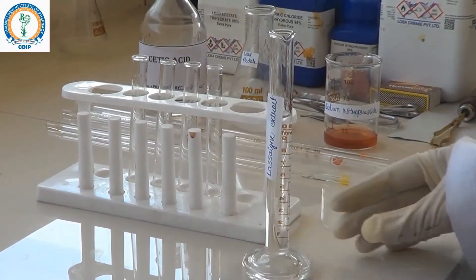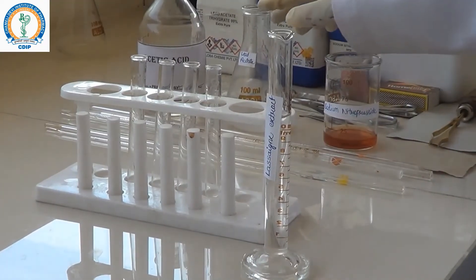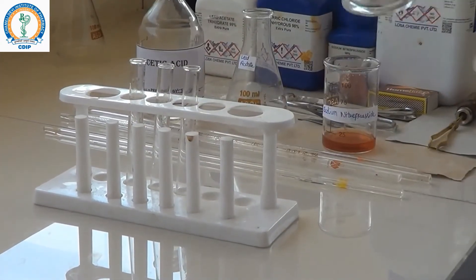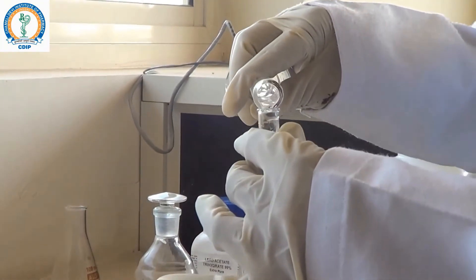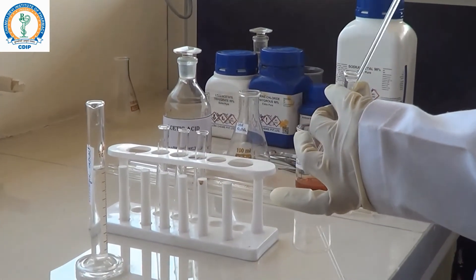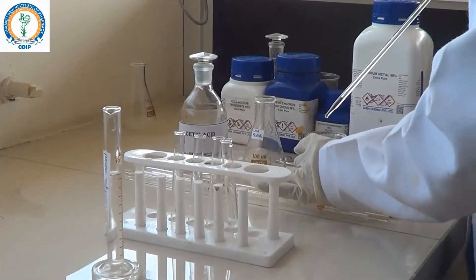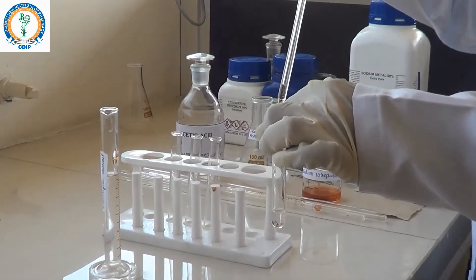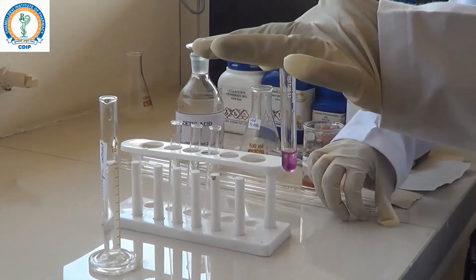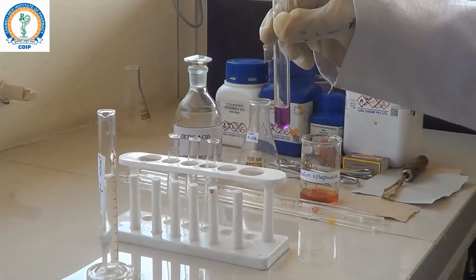For the detection of sulphur, there are two tests: one is the sodium nitroprusside test and another is the lead acetate test. First we will perform the sodium nitroprusside test. Take a small portion of this Lassaigne extract into a test tube and add a few drops of sodium nitroprusside. You can see the purple colour formation, which indicates sulphur is present in the organic compound.